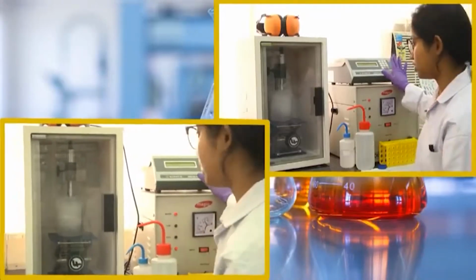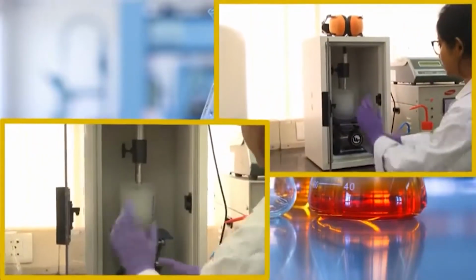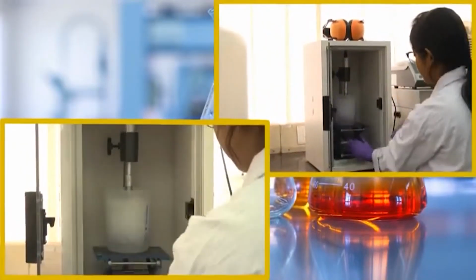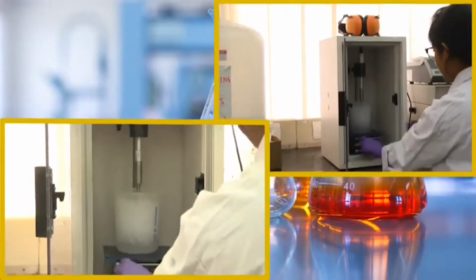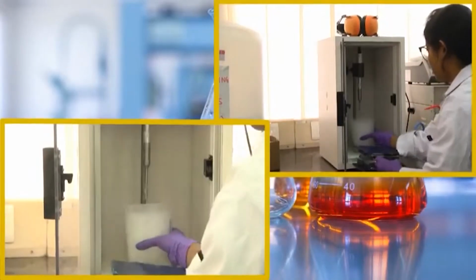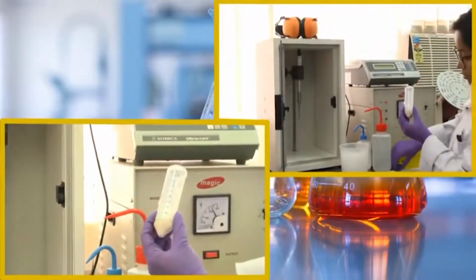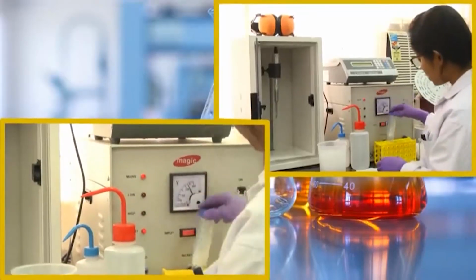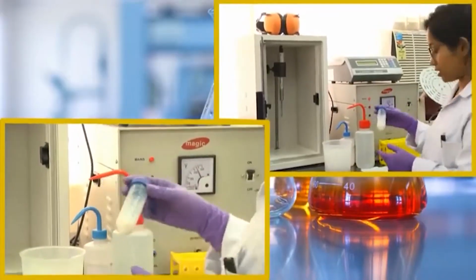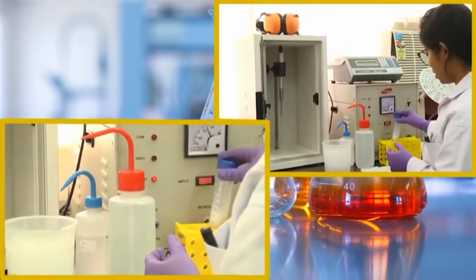Our sonication is done now. It will be stopped by the machine because 25 minutes are over. After that, we will take out the sample from the platform, and the sample will be liquidy again. After this, we will go for the centrifugation of this particular sample, where we will separate the insoluble fraction as well as the soluble fraction.